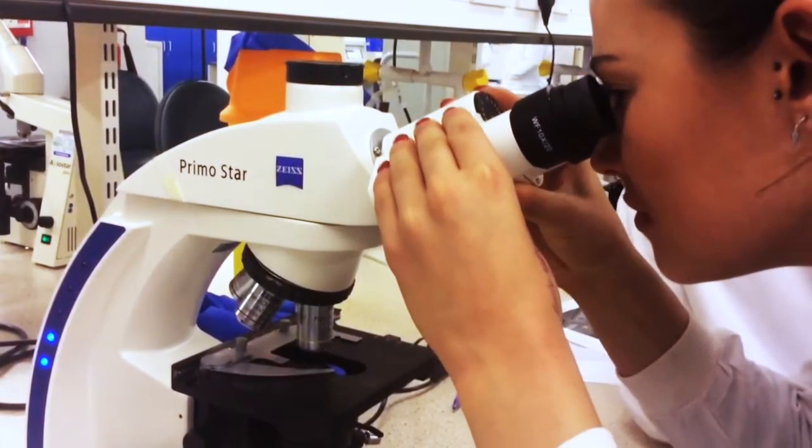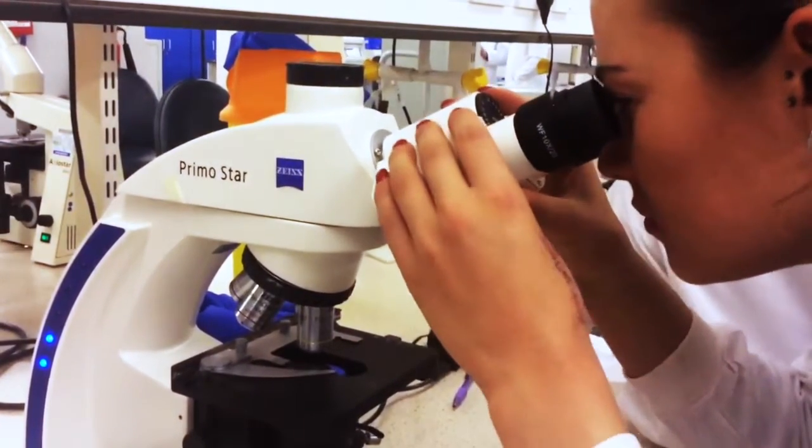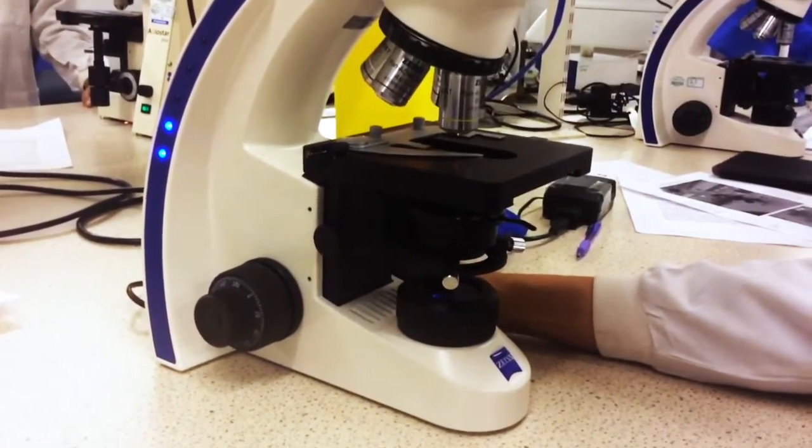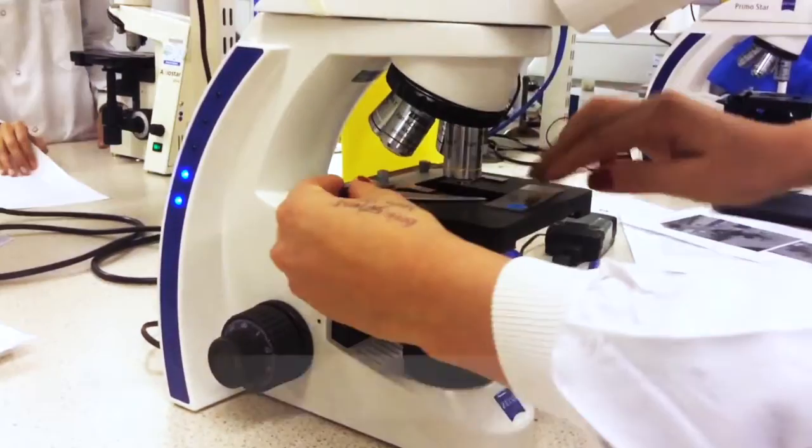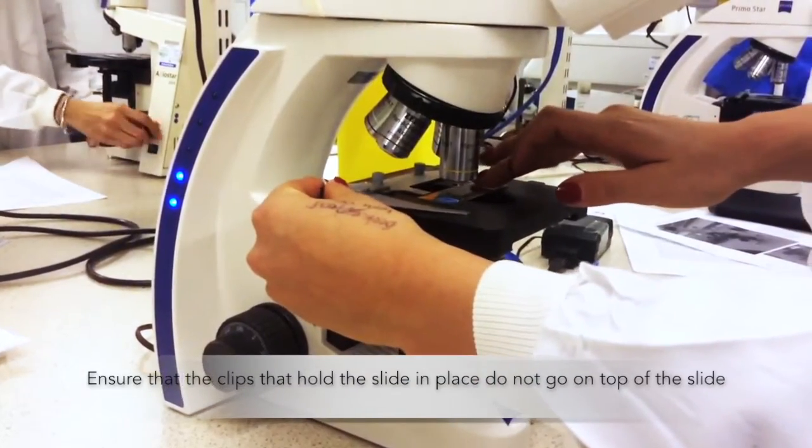To obtain a single circular view, adjust the eyepiece separation. Watching from the level of the stage, bring the stage up towards the objective lens. Then place the slide mounted preparation on the stage.